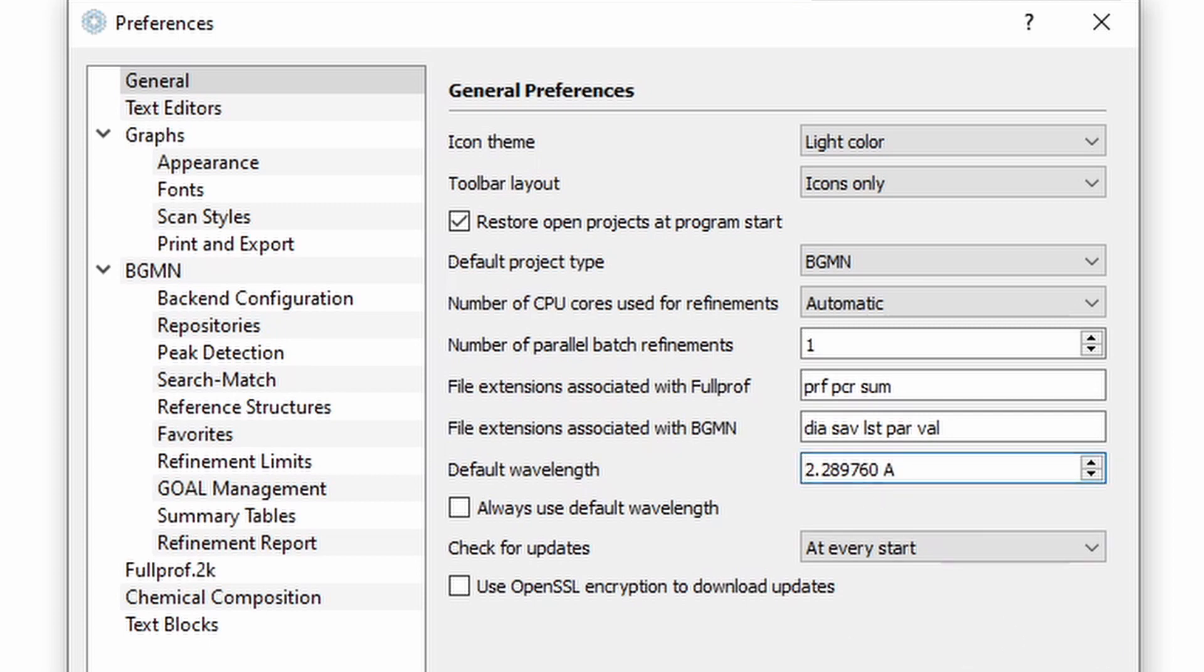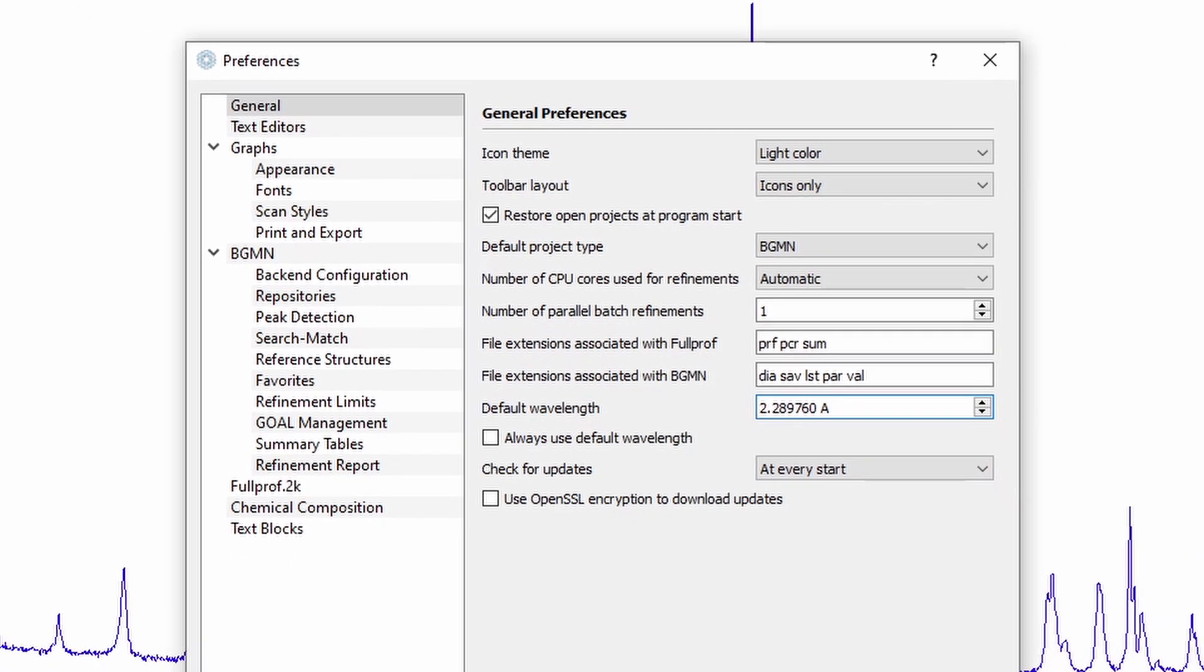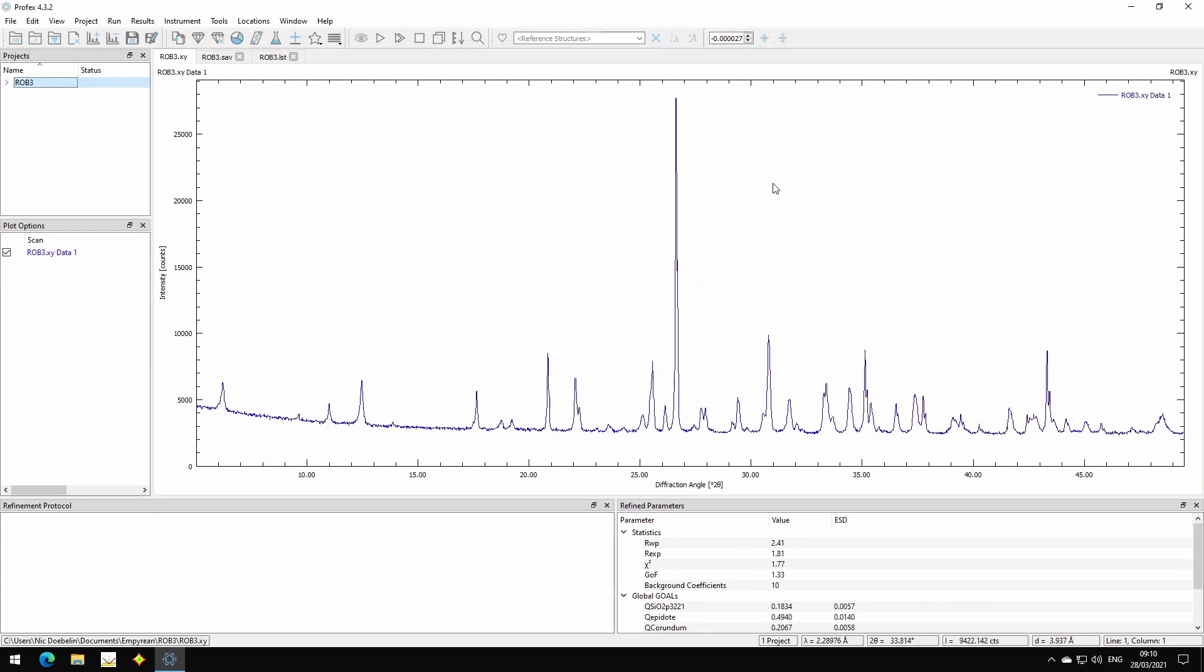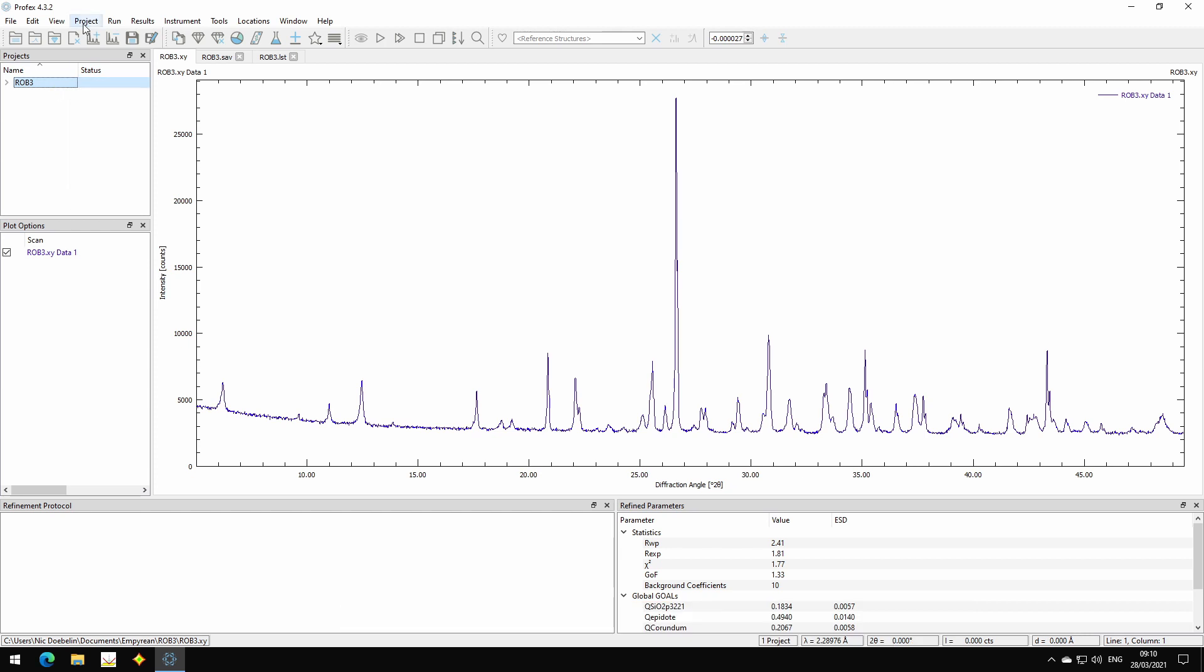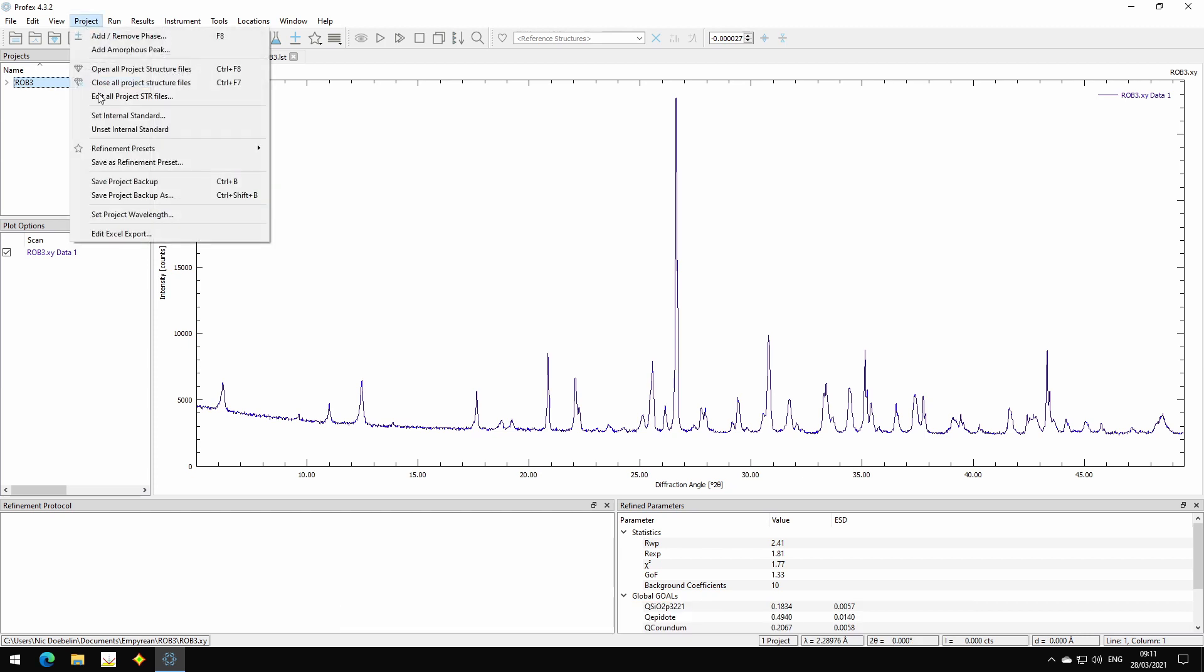But this is actually wrong. So this file was not measured with chromium radiation. It was measured with copper k-alpha-1 radiation. But it just uses the default wavelength we configure in the Preferences dialog. And now in this new version, we have a new feature in Project. We can override this and change the wavelength by selecting set project wavelength.